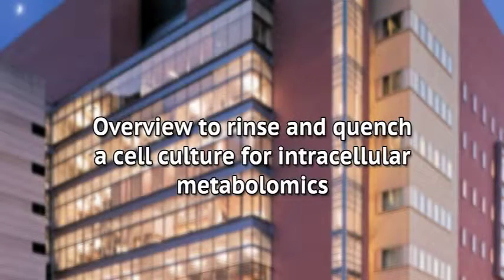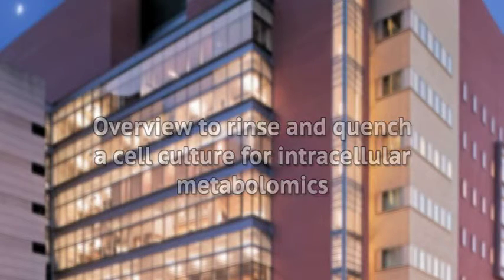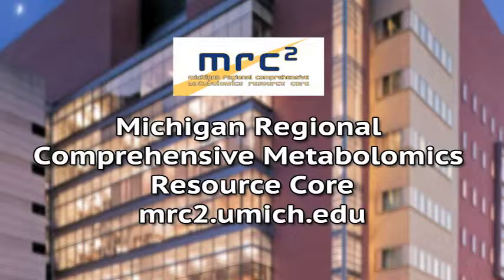This video will provide an overview of the steps used to rinse and quench a cell culture in order to collect a sample for intracellular metabolomics. For samples being sent to the Michigan Regional Comprehensive Metabolomics Resource Core for analysis, please contact Core staff for additional instructions about extracting, drying, or shipping your samples.